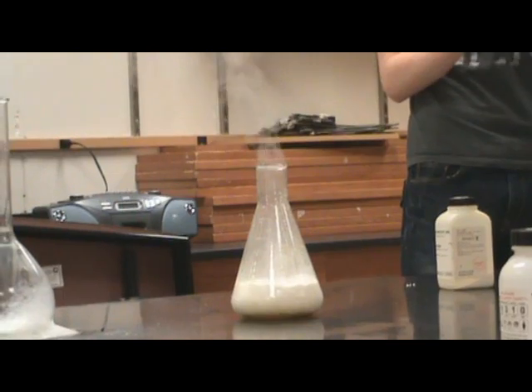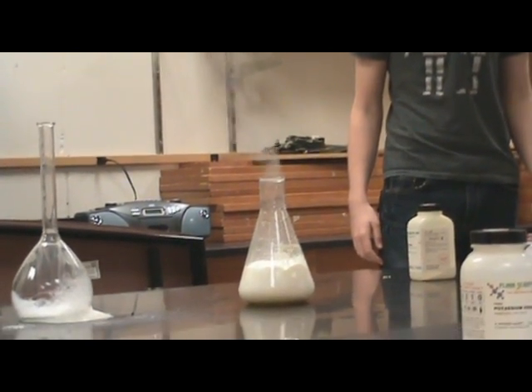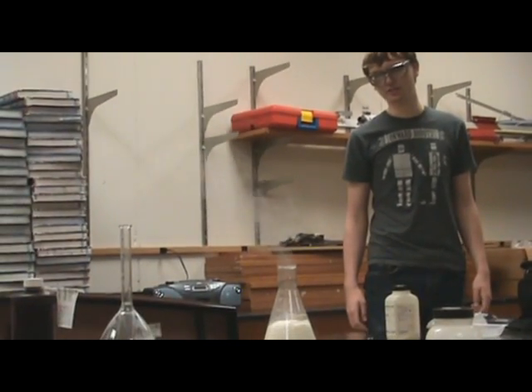Oxygen gas is being produced. That foam doesn't look like water to me. Oh, it's getting higher. It's growing.